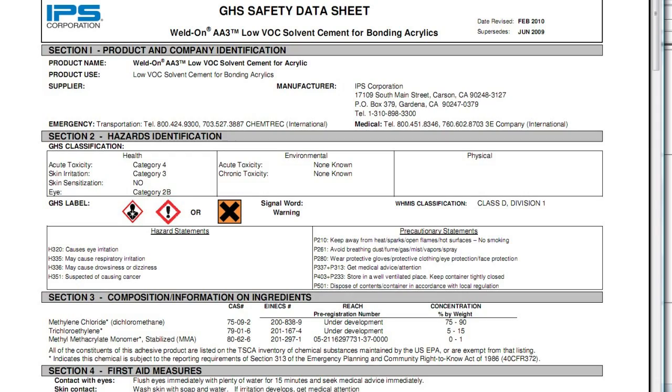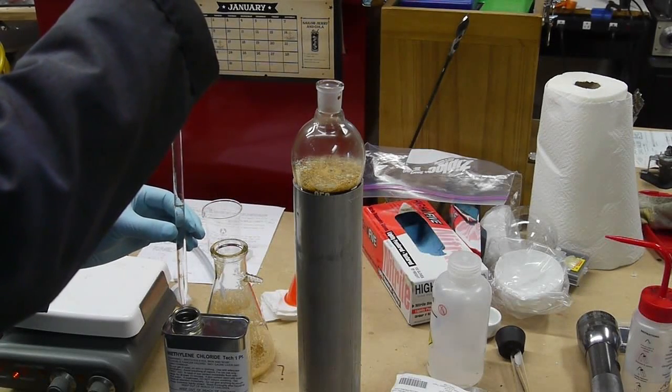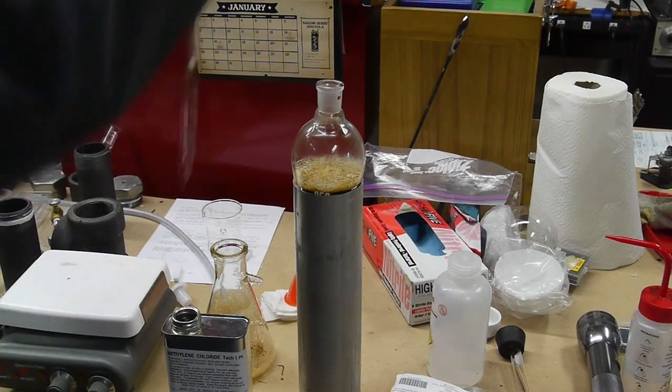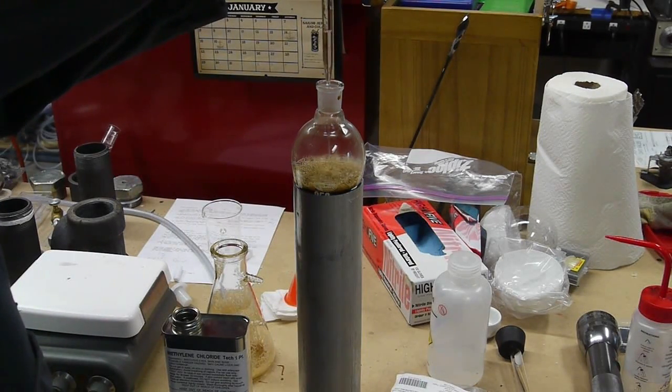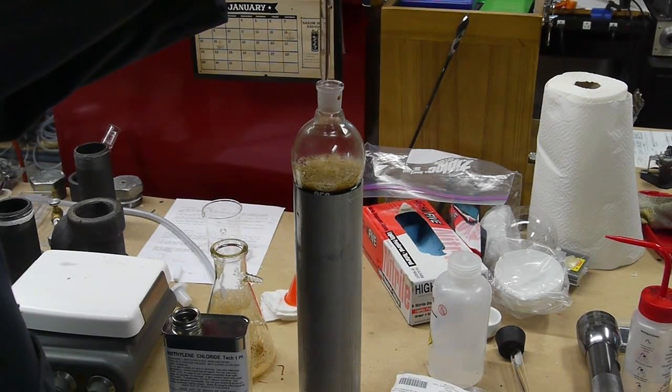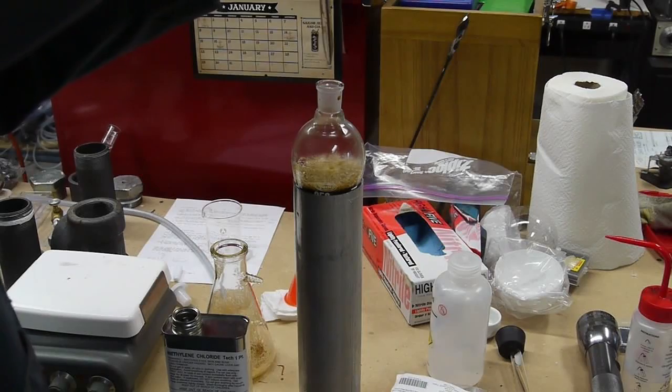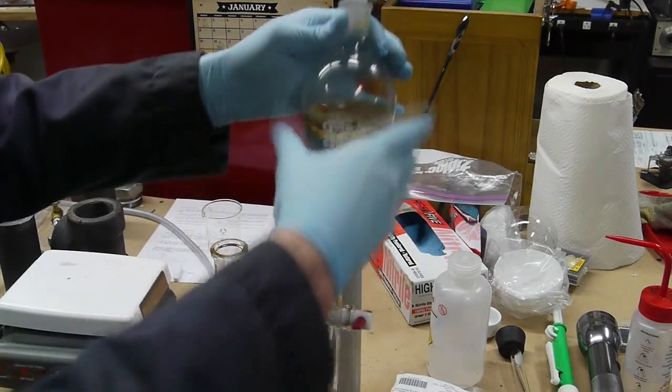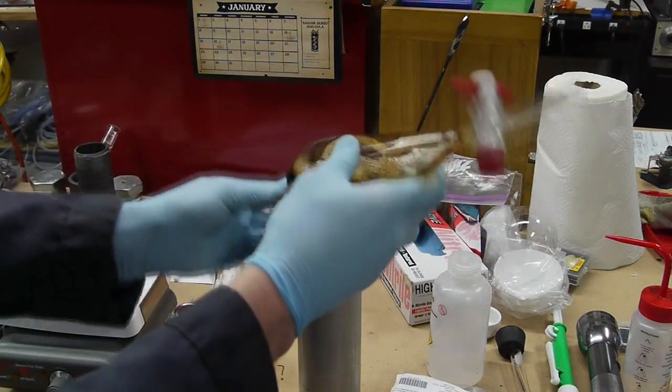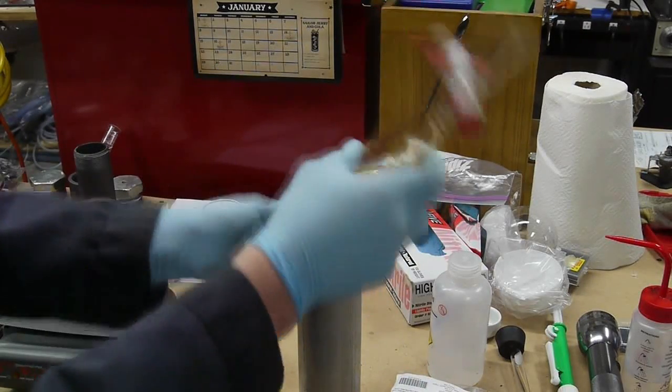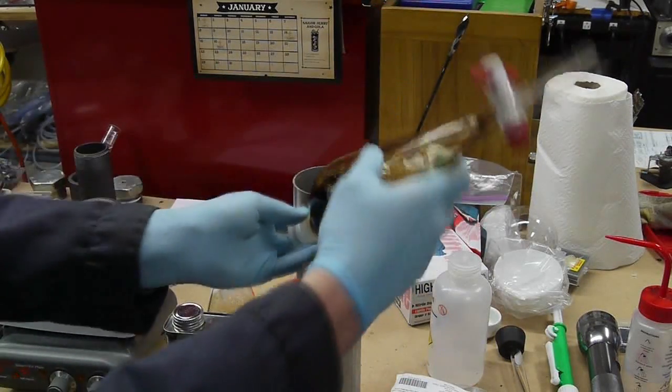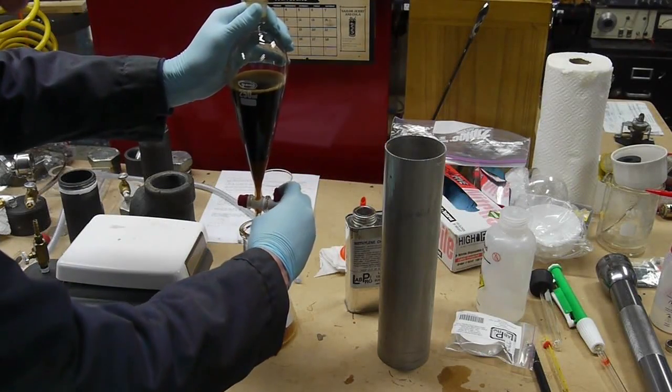So the idea is to add some methylene chloride to the separatory funnel along with the aqueous solution of caffeine. And by mixing it around a bit, all the caffeine will be transferred into the methylene chloride because it has a much higher affinity for dissolving caffeine. Then by emptying the separatory funnel carefully, you can extract the caffeinated methylene chloride. When you boil away the methylene chloride, you're left with really nice crystals of caffeine.